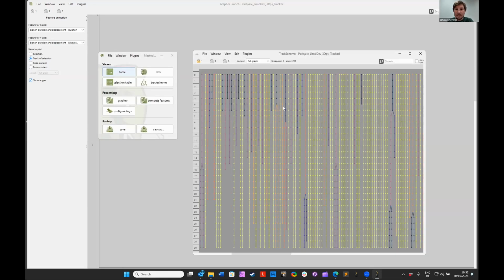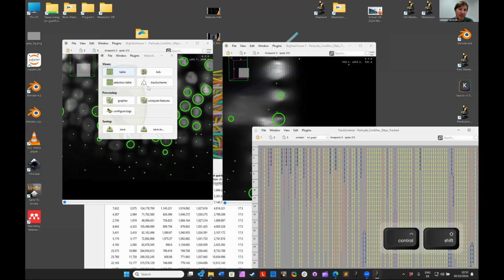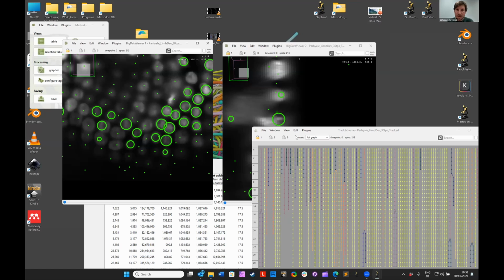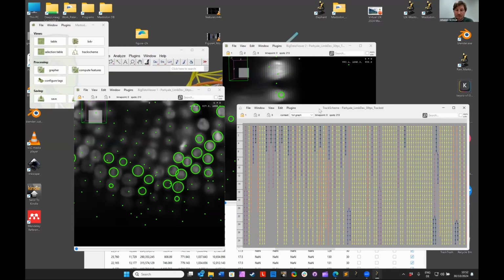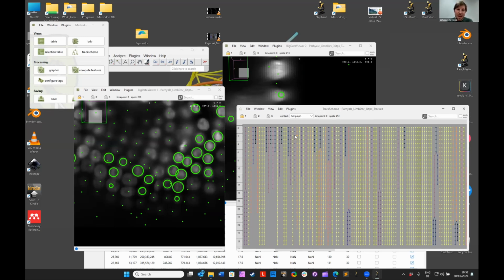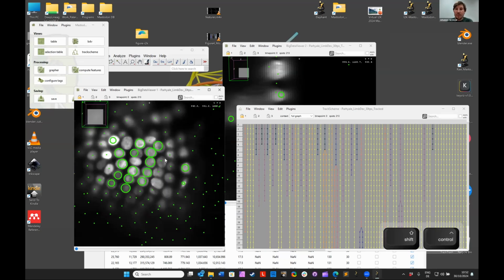So this is now the same data set. I'm sorry for this. So there was a problem with saving. Maybe I closed it too fast, the Fiji, and then the saving is basically not done yet. And also Mastodon is still in development. So that will hopefully not happen if you are tracking. Yeah, so then everything should pop up exactly the way you leave it, and that's a nice thing.